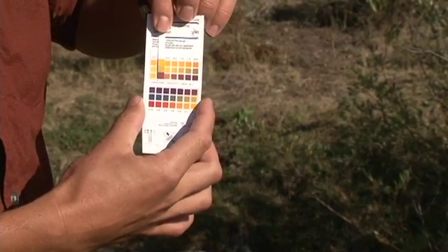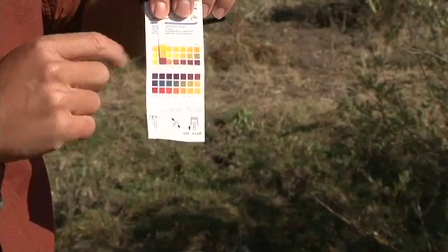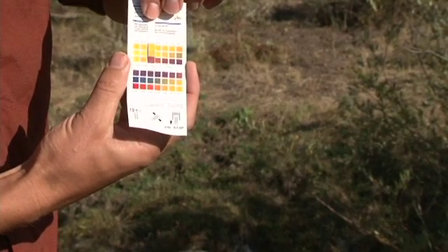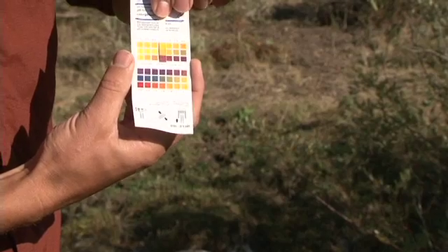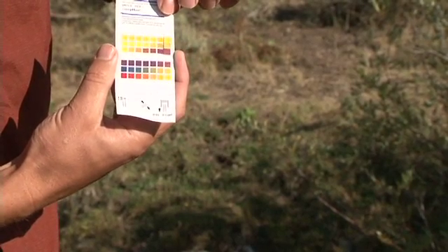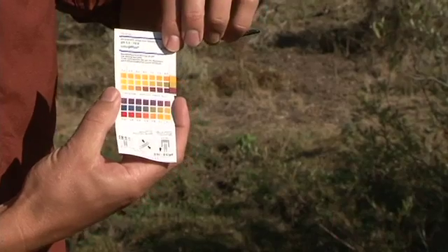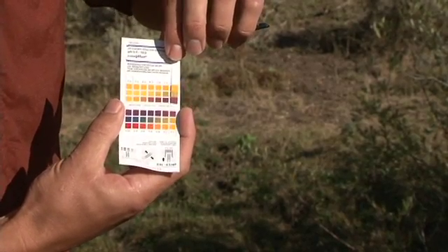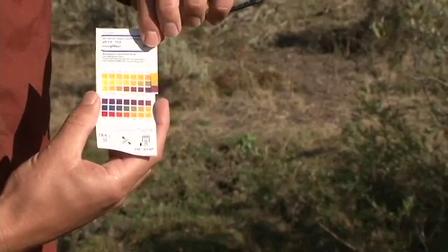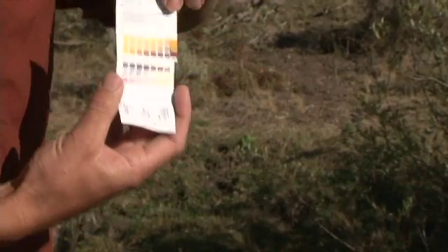The next step is to compare the test pH strip to the known colors. You're going to compare all three colors. This one is for a pH of 5 — you can move it along as it goes up in half-unit increments, and you want to find the one that matches most closely all three colors. You want to look at an even lighting source, either all shade or all sun. I would say this one most closely matches with a pH of 8. So this is what I would record on my data sheet: pH 8.0. This is in our healthy range.